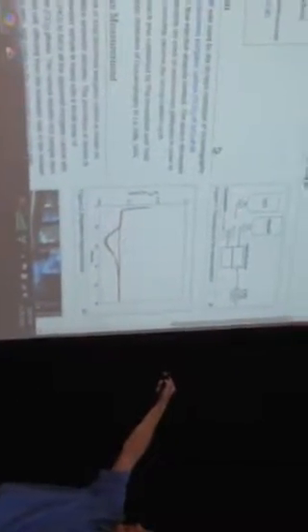Okay, so this was the group I was telling you about. This is in Scripps in San Diego. What they want to do is measure total dissolved inorganic carbon in seawater. Now, how do you do this? Well, they're going to get a discrete amount of seawater and mix it with hydrochloric acid. It goes into this mixing chamber, and it's going to go on this side. Now, there's a membrane here which is being filled with sodium hydroxide, so the carbon jumps across and gets measured with the C4D.